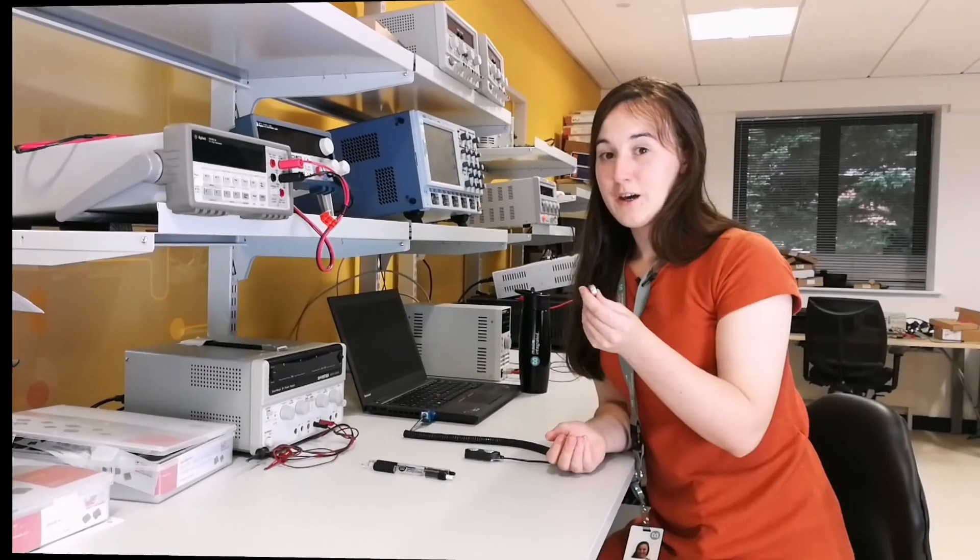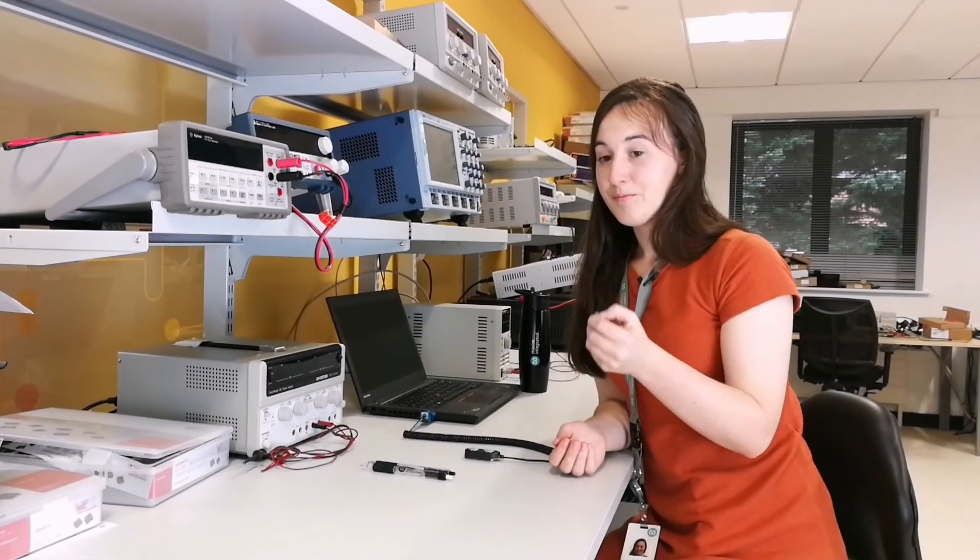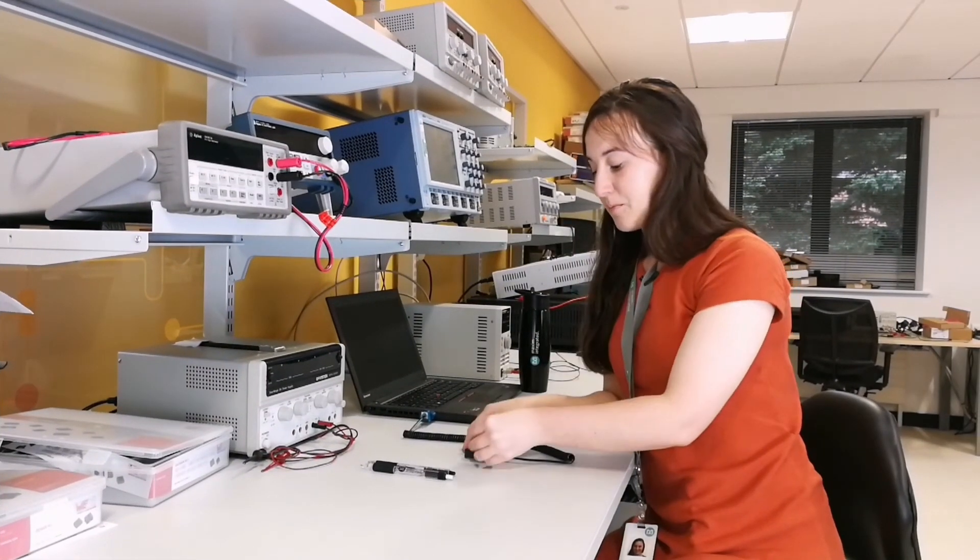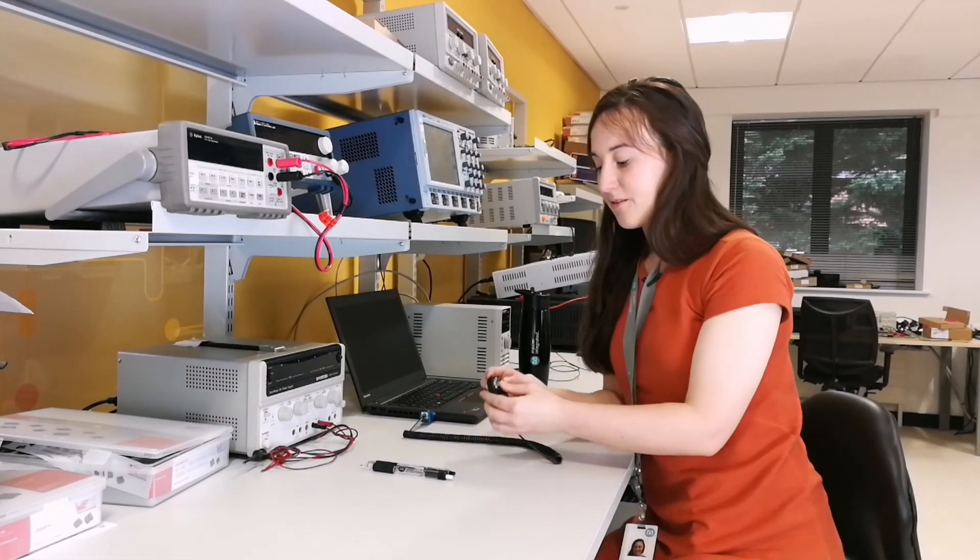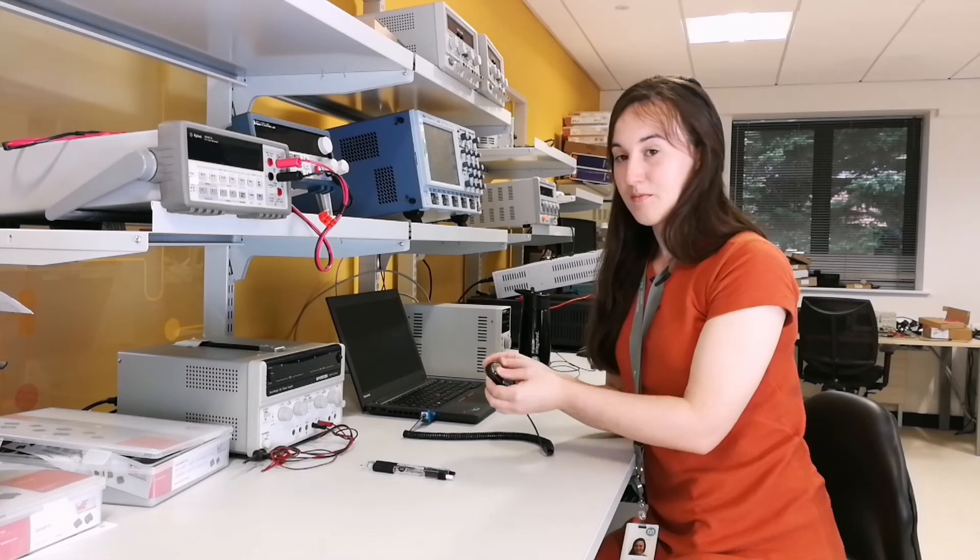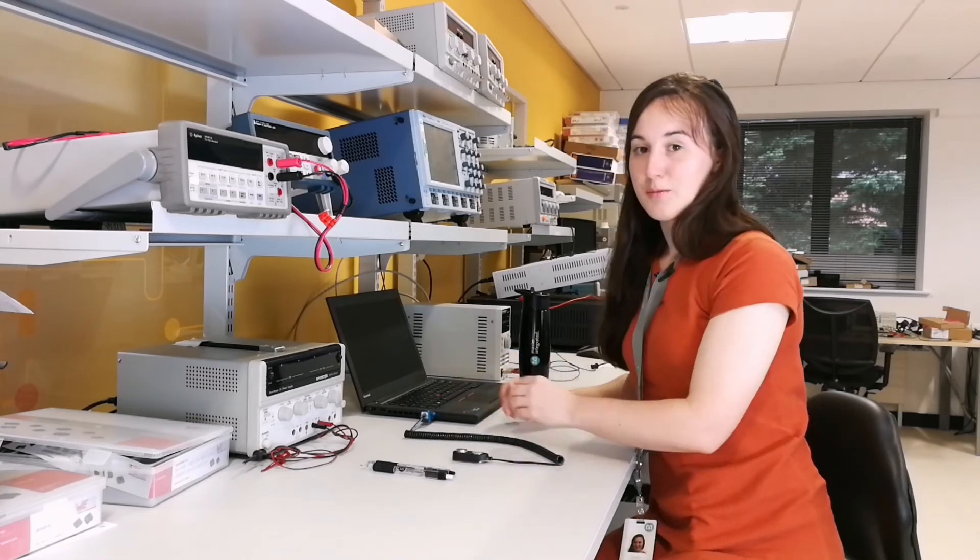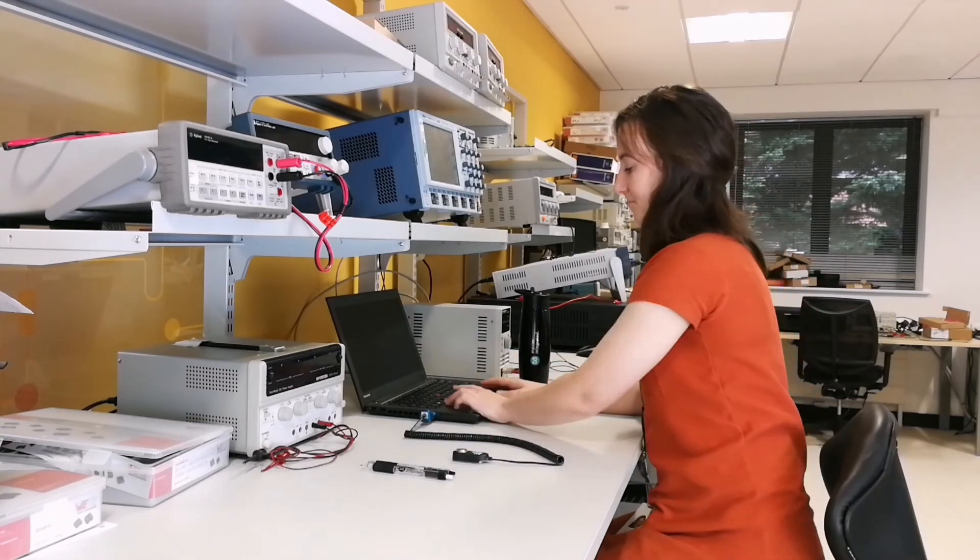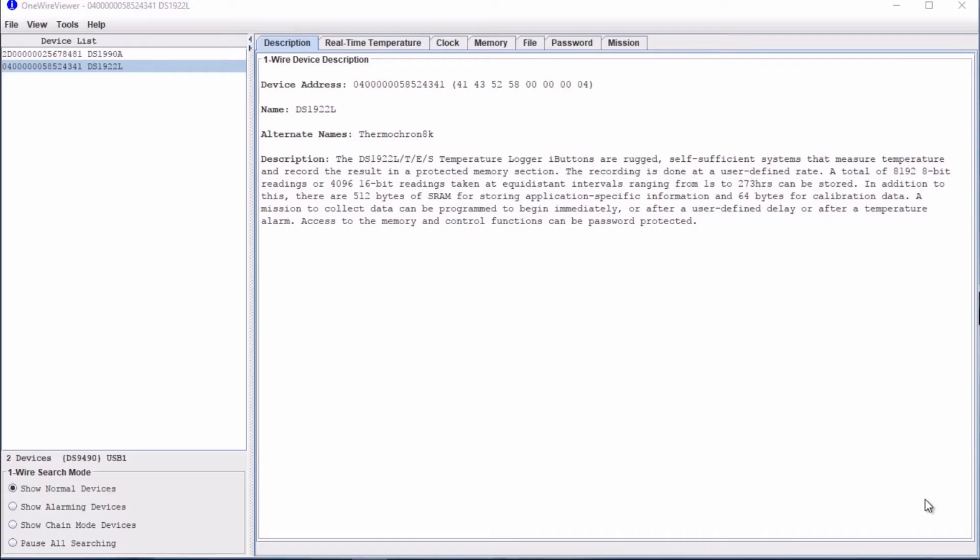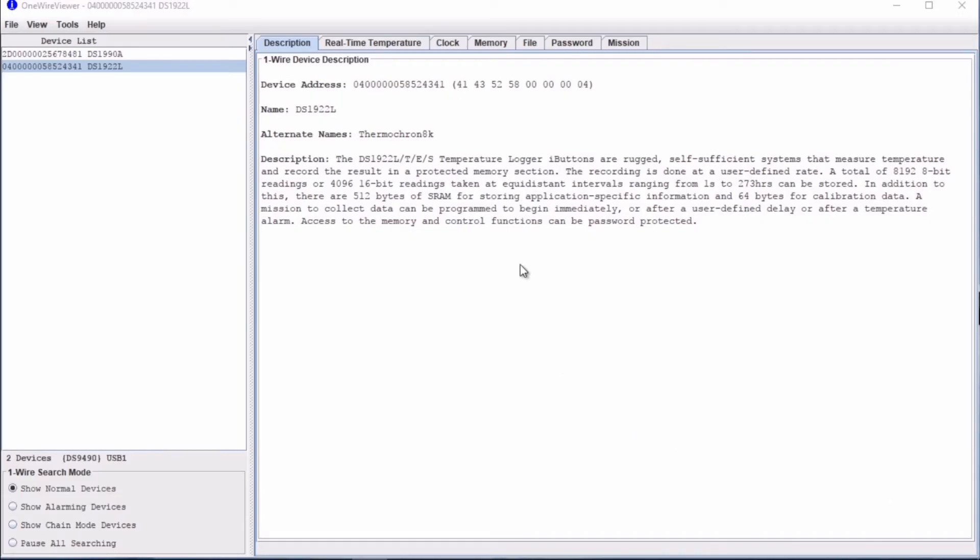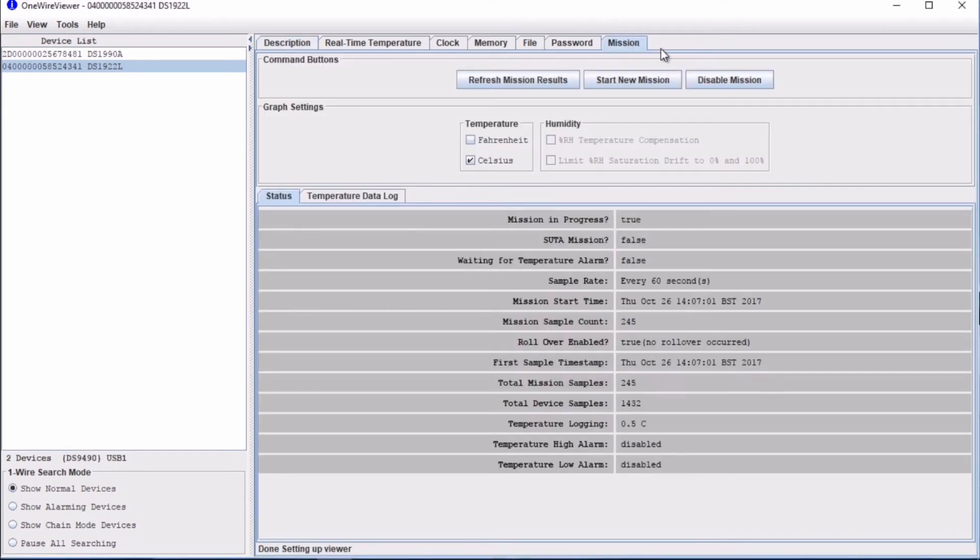So now I have the iButton. We just click it back into place and open up the OneWire viewer software. From here, we go back to the mission tab and click disable mission. This stops the iButton from logging more data.